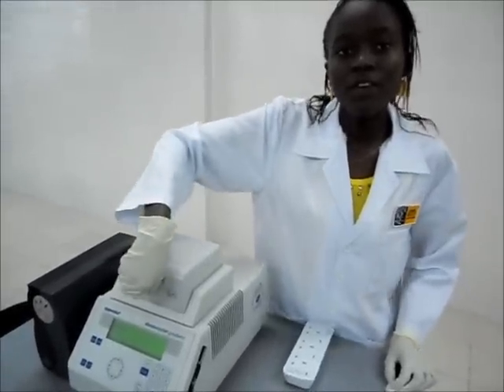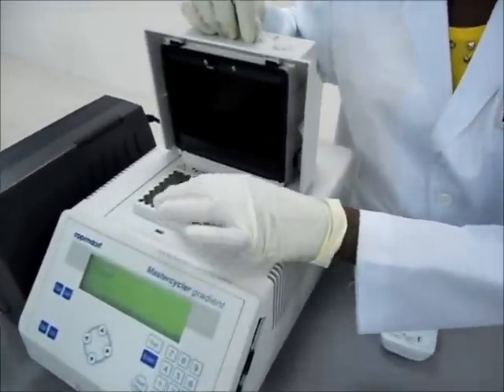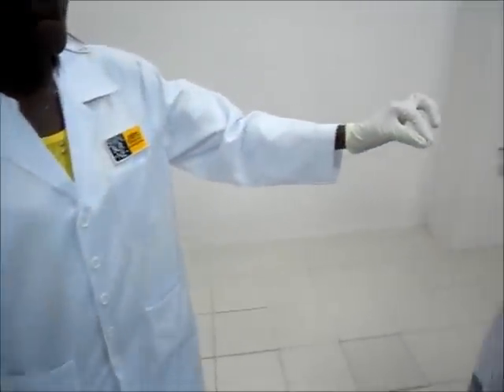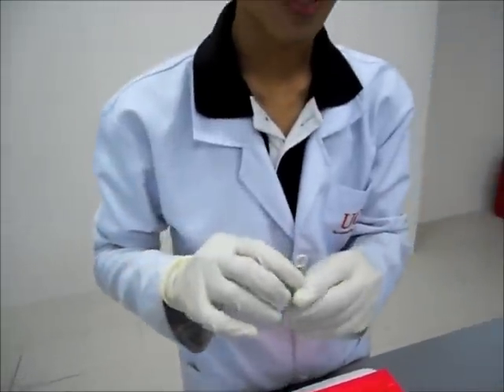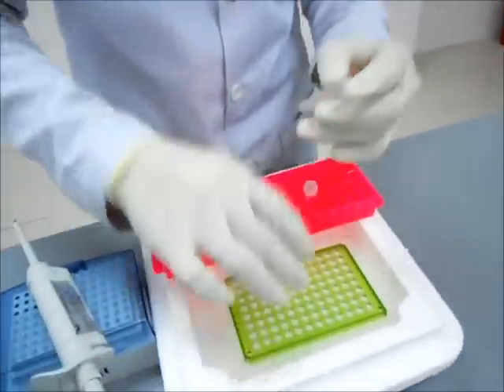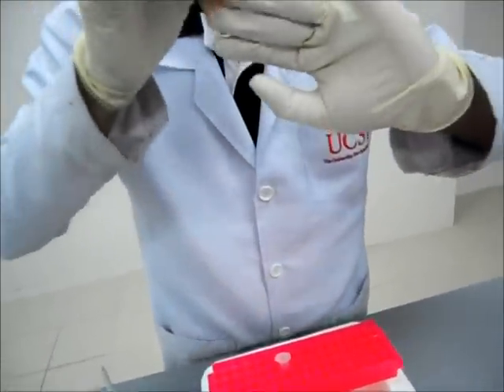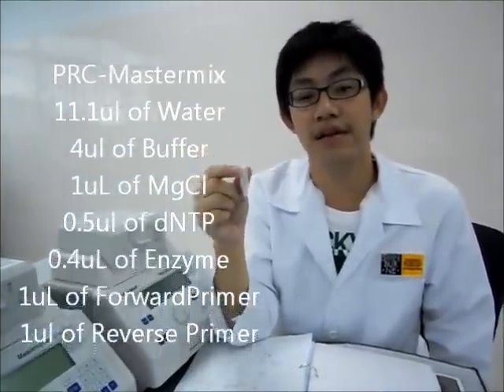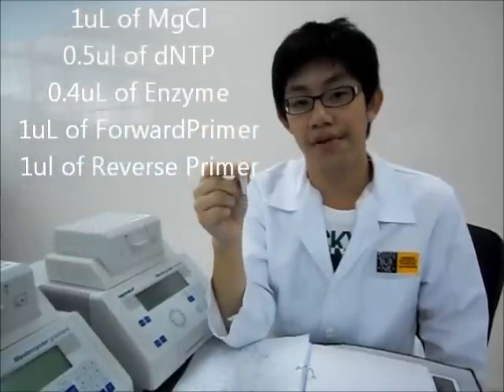So after an hour, we take out our final mixture. And now I'll be adding the PCR-master mix into the sample. PCR-master mix is similar to RT-master mix, except that the enzyme used is Taq polymerase and the primer is a specific DNA primer.